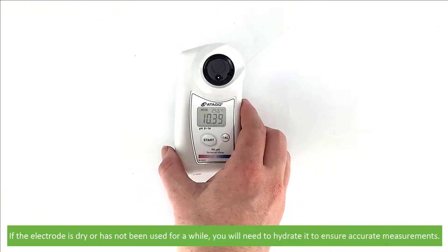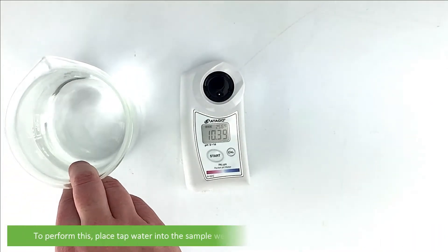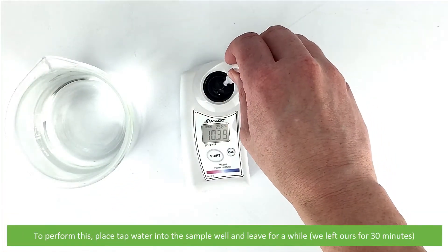If the electrode is dry and has not been used for a while, you will need to hydrate it to ensure accurate measurements. To perform this, place tap water onto the sample well and leave it for a while. We left ours for about 30 minutes.